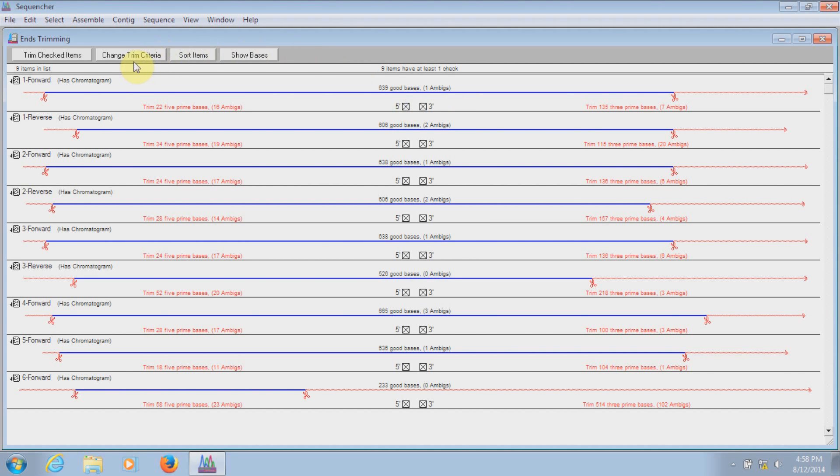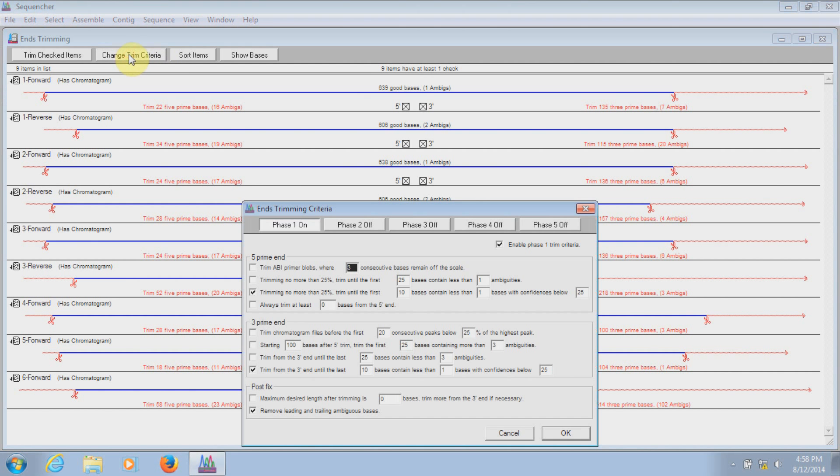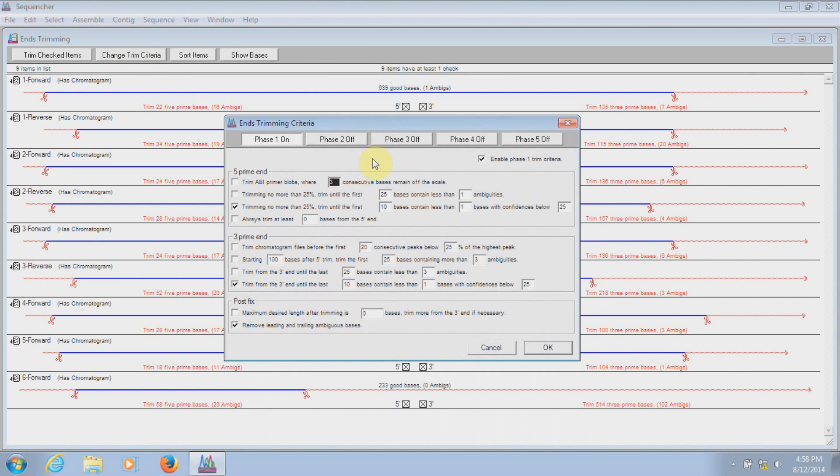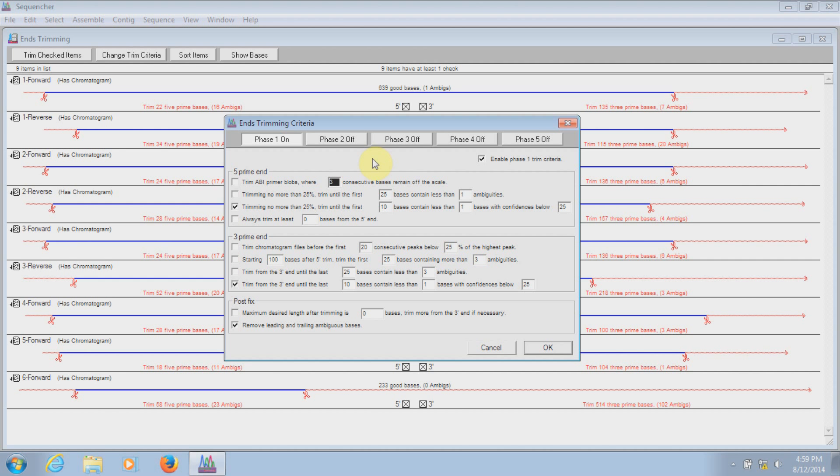Let's click on the Change Trim Criteria button. This brings up the Ends Trimming Criteria window. In this window, you can set the criteria that will determine how much of each sequence to trim. Here, this is based on confidence scores, but I could have set it based on the amount of ambiguities.